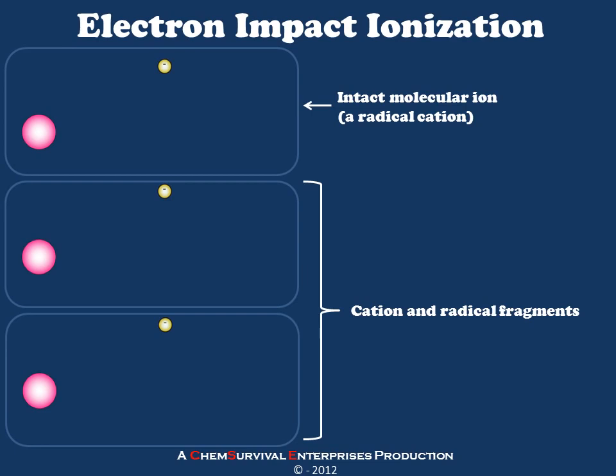Let's begin by considering how to ionize a molecule. And I'll be showing you today one of the most basic but most widely used ionization methods in mass spectrometry. That is electron impact ionization.